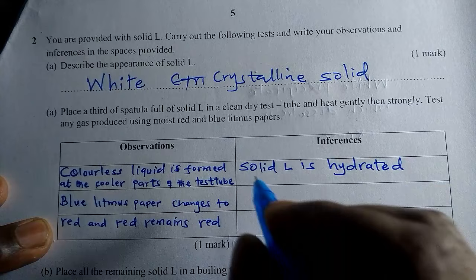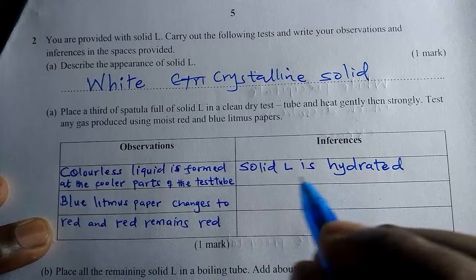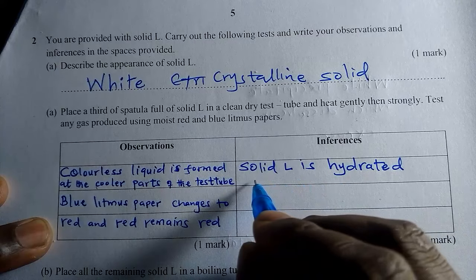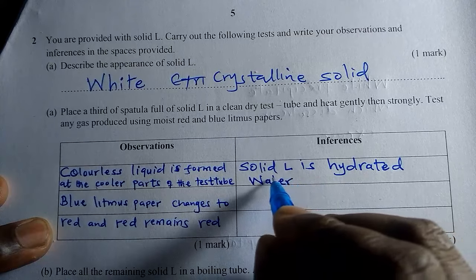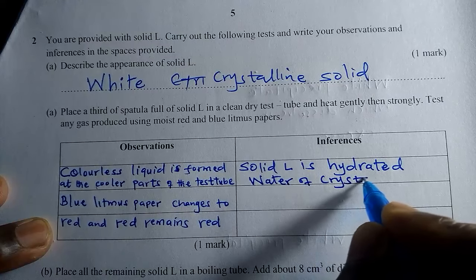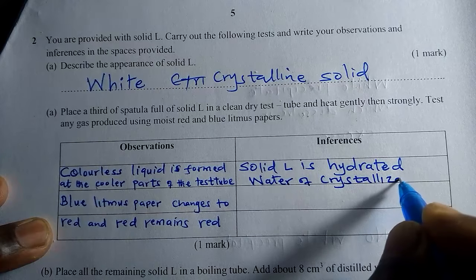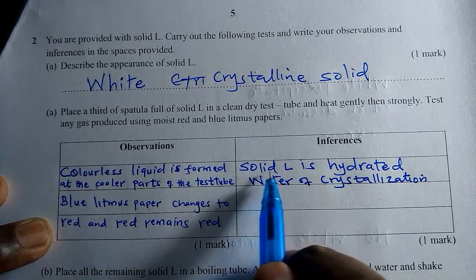Or, when I say or, you don't need to use this one. You can say solid L contains water of crystallization. So you choose one. Either you say solid L is hydrated, or you say solid L contains water of crystallization. You pick one.